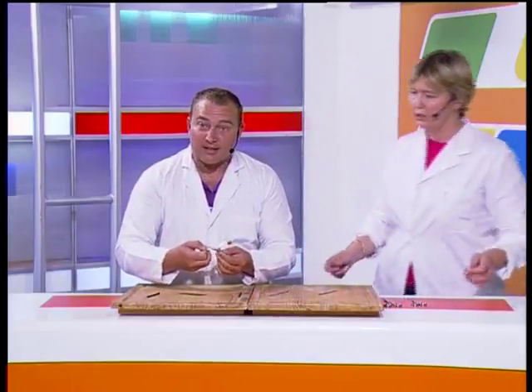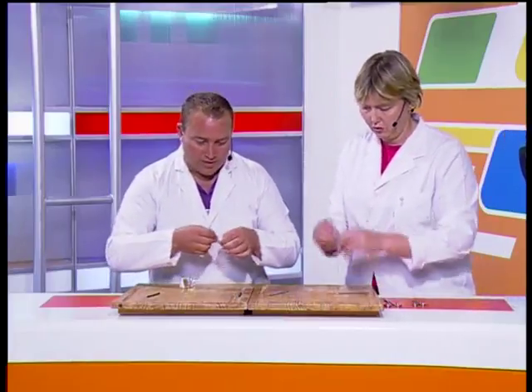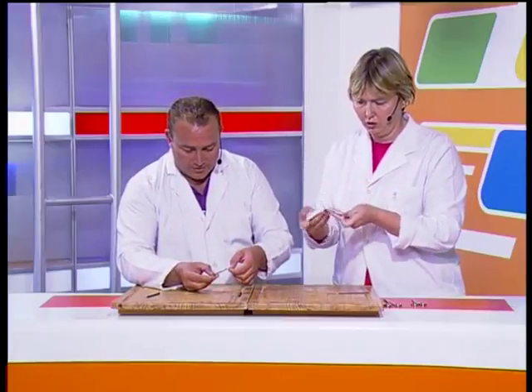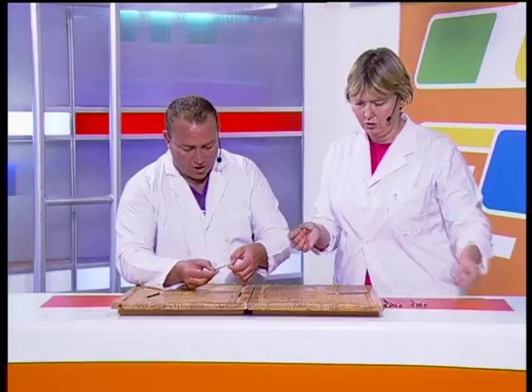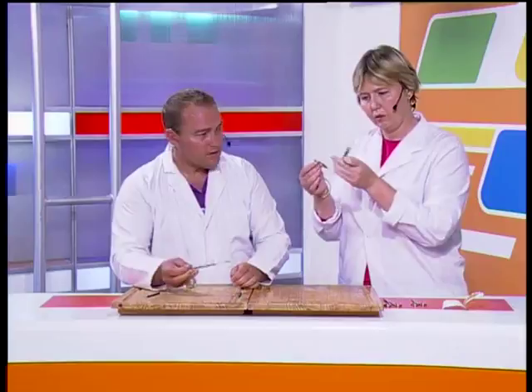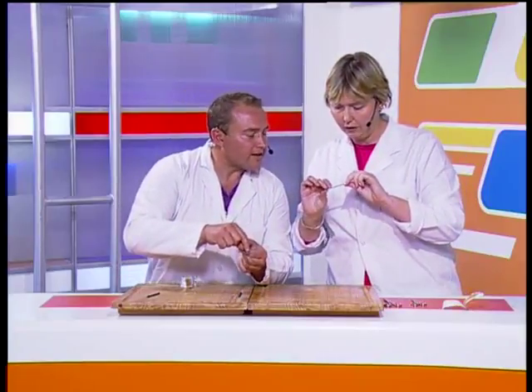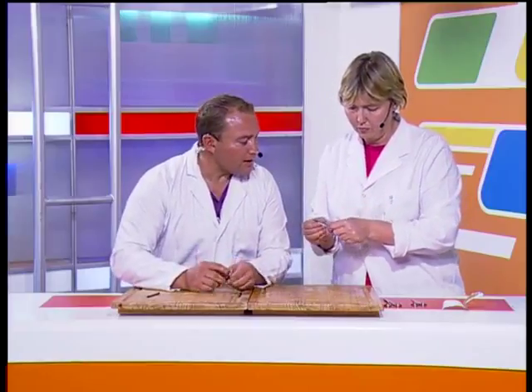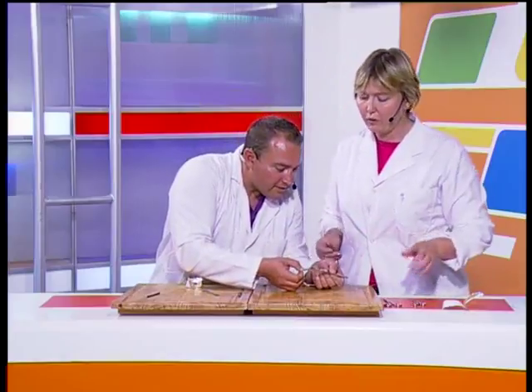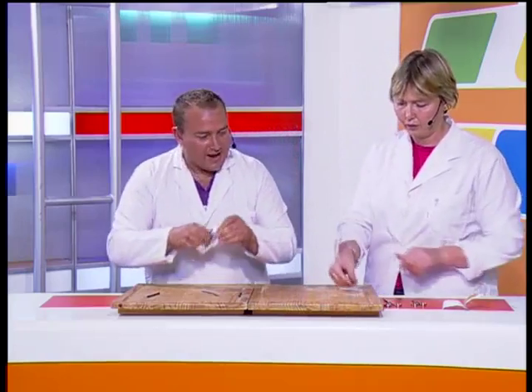So let's open everything up. You'll notice that they're nice and sealed, just to make sure that they stay right. Do you want to do yours while I do mine? They can only go in a certain way. These are pretty sharp. They're not just sharp, they are very sharp. So please watch your fingers. Which way around do they go? You'll see that there's a groove. It's got to follow the groove, and this goes in like that. So just make sure that you plug it in right. Plug it in and then slide it all the way. And now it's nice and solid. And we get rid of the stuff.